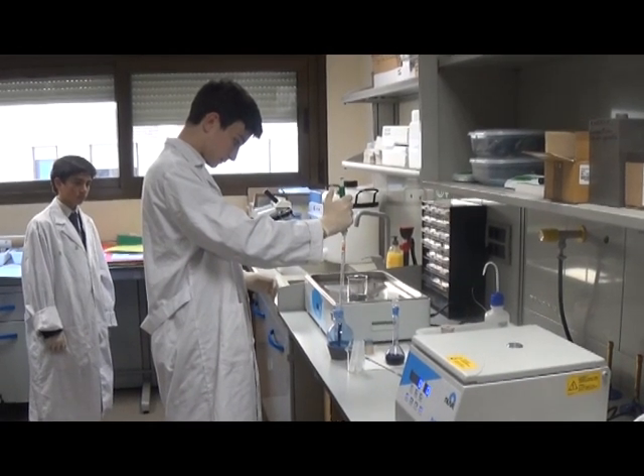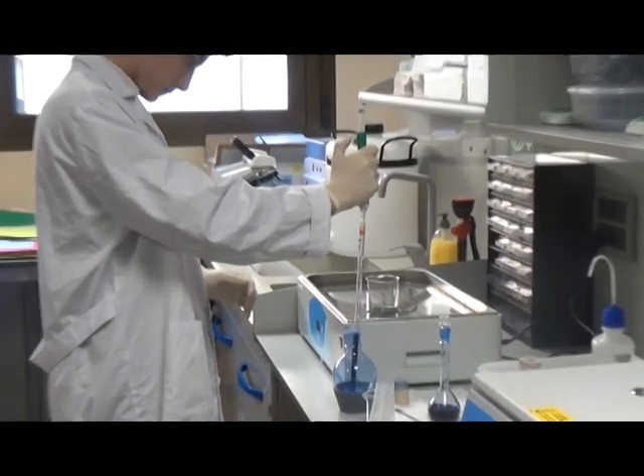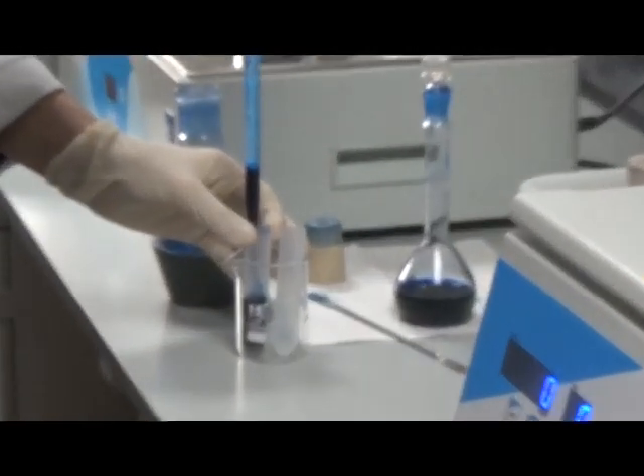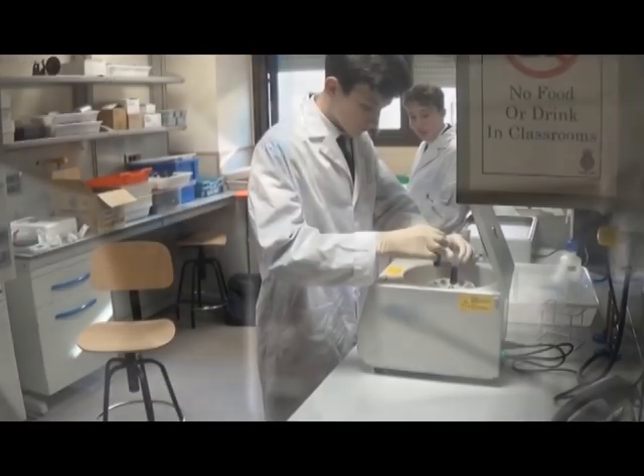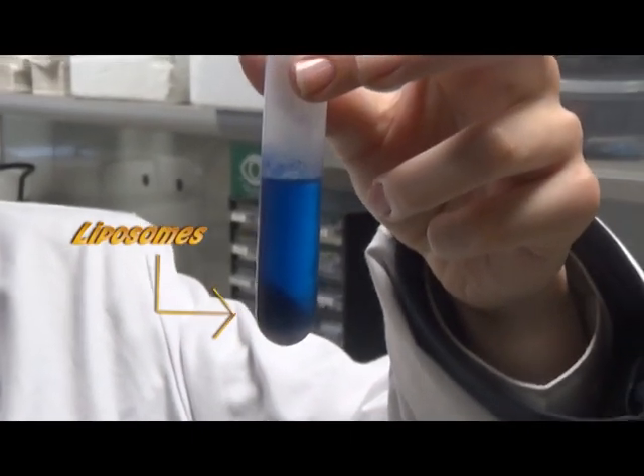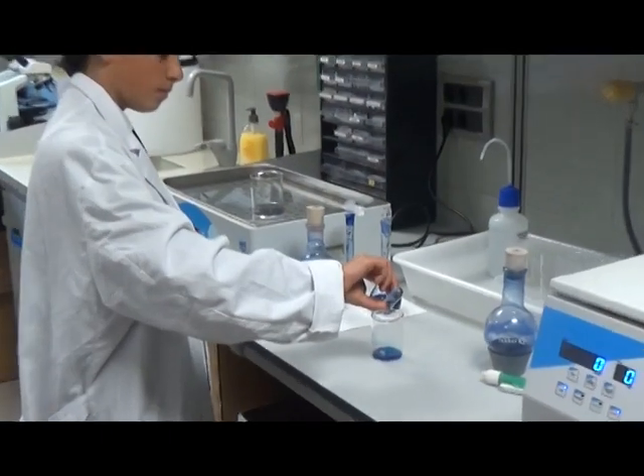But not all the methylene blue is entrapped within the liposome. To remove any excess dye, we use a centrifuge. We transfer our liposomes to the centrifuge tubes. The centrifuge spins the samples round at high speed. The liposomes are spun to the bottom as the pellet. The top layer is then decanted, ensuring all the excess dye is poured off.